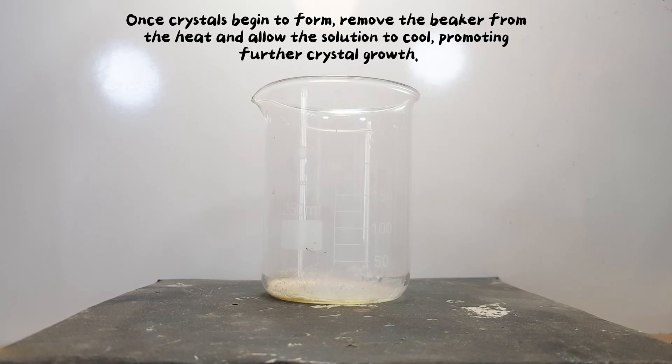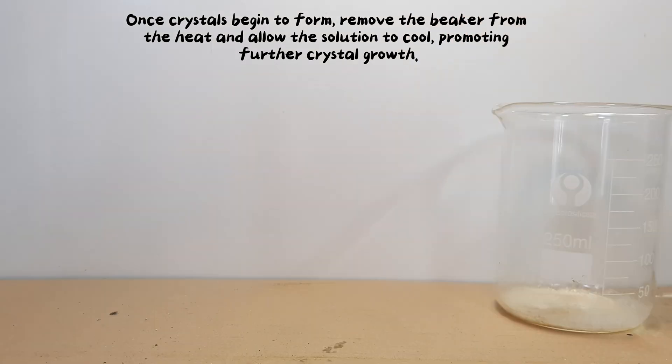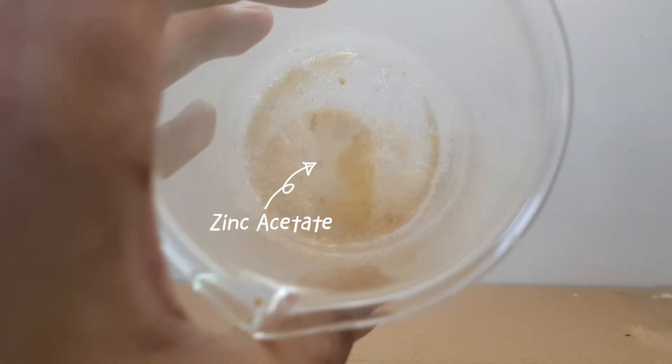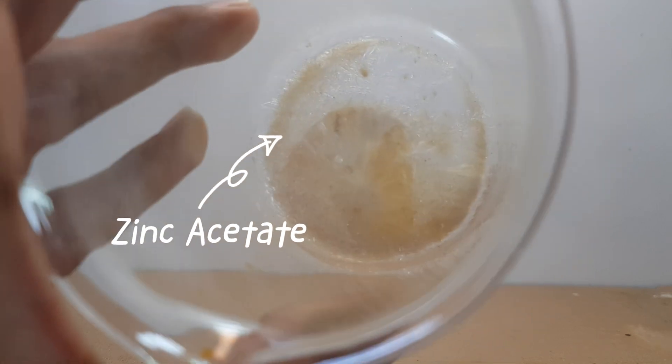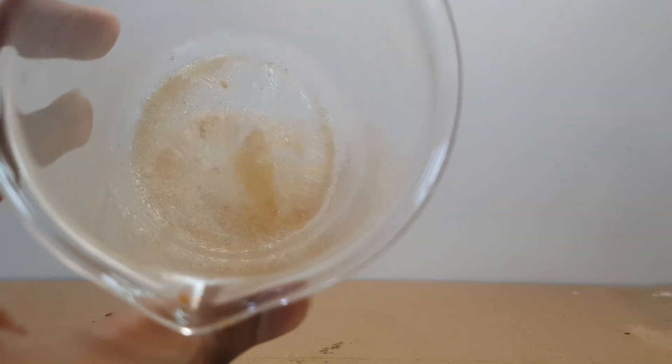Once crystals begin to form, remove the beaker from the heat and allow the solution to cool, promoting further crystal growth.